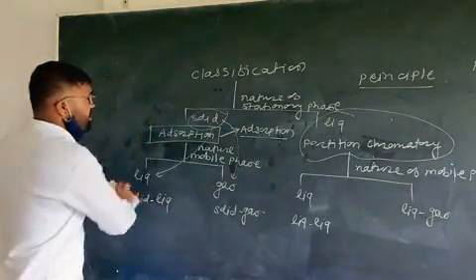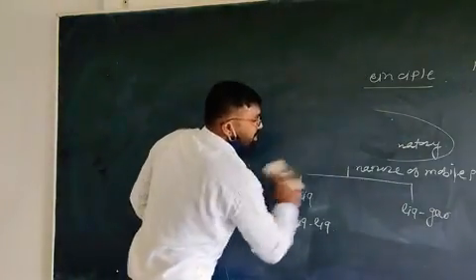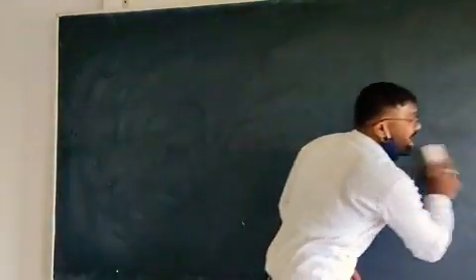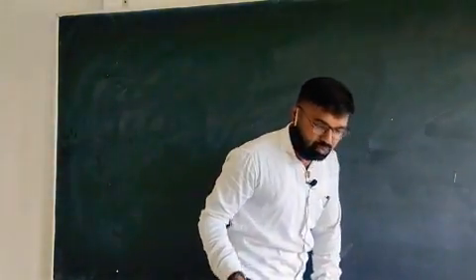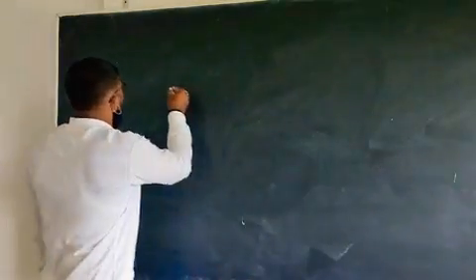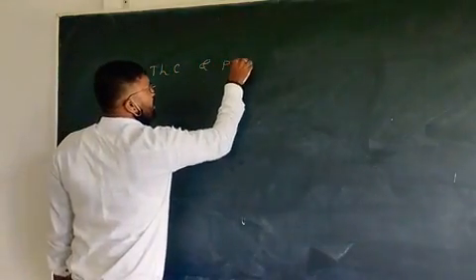During chromatography, various instruments or various techniques are used, okay. If you discuss the various techniques, some are instrumental and some are non-instrumental. In our syllabus, two kinds of chromatography are used, TLC and paper chromatography.